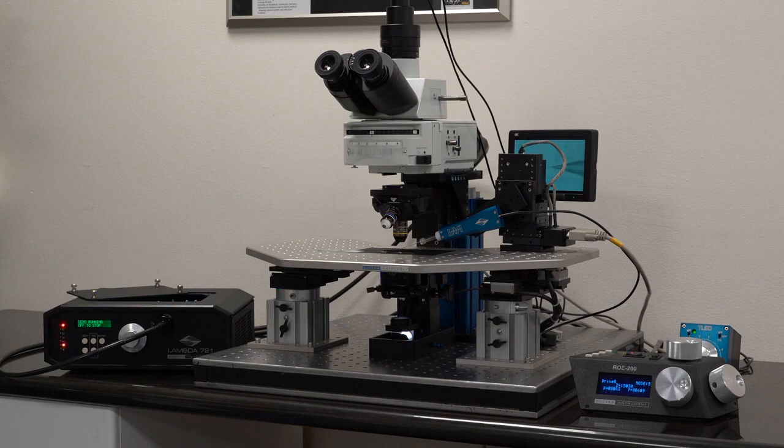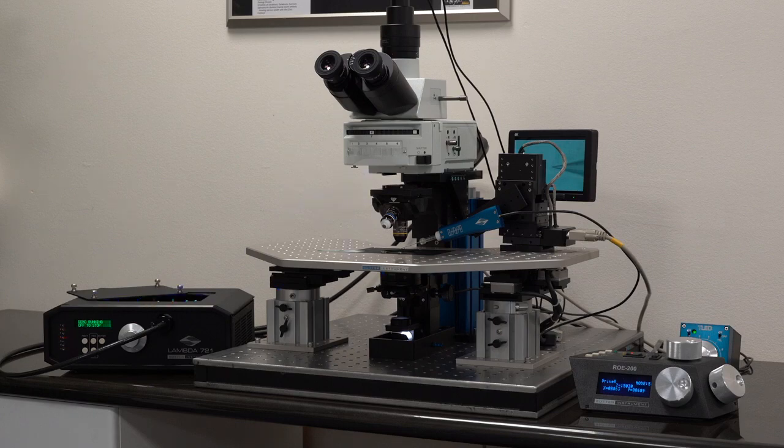My name is Chris and I would like to introduce the NAN. This is a microscope for either patch clamp electrophysiology or in vivo. And what I mean by that is the microscope is height adjustable.